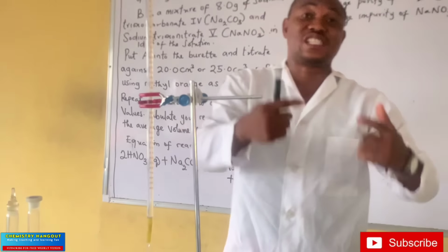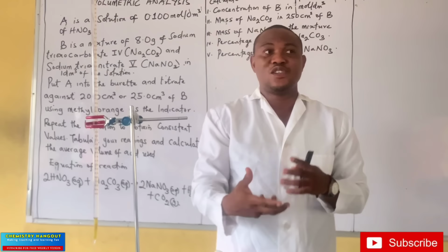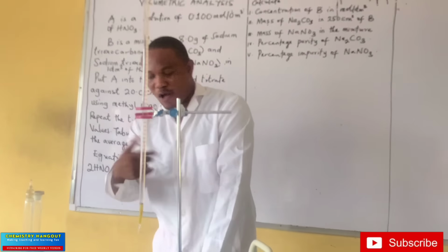I've even taught on this channel how to prepare your table when you already understand what you are doing, right? So I'll just do 1 or 2 of the titrations, then we'll go to the calculation. Very simple, just pay maximum attention. So come closer, let's see.